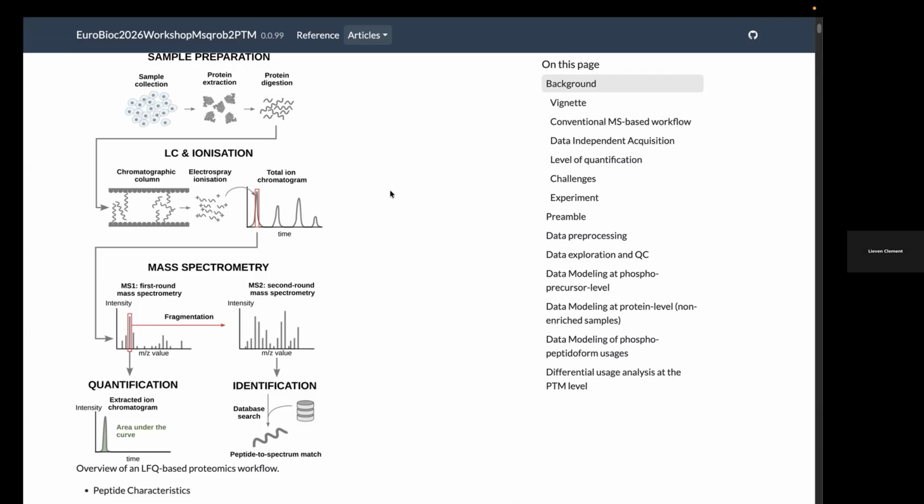And then for this precursor, this peptide, we don't know what the peptide species is. So we typically take that peptide and fragment it in a second round of mass spectrometry to have a kind of fingerprint, and that is then used for identification. So we typically use MS1 for quantification and MS2 for identification. One of the issues that also happens is that sometimes peptides are misidentified, and I attribute a wrong peptide to the wrong protein. So we also have outliers, highly variable peptide quantities.